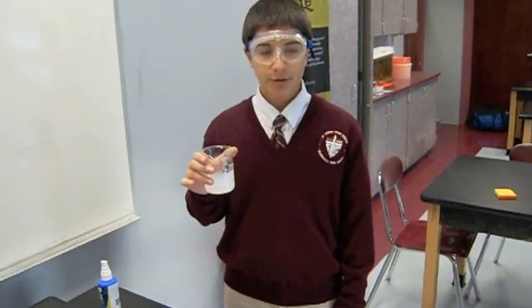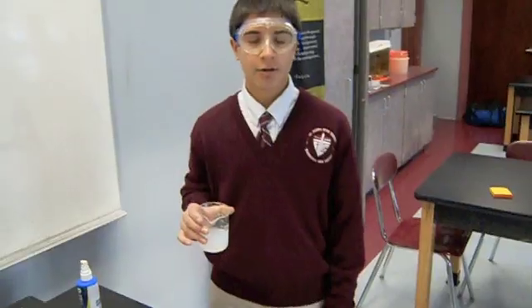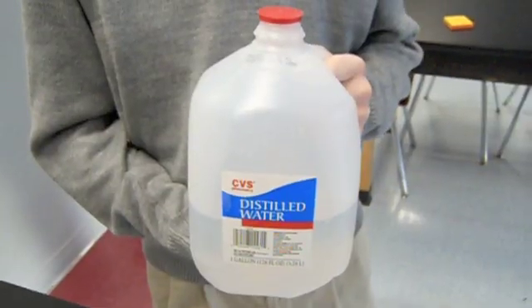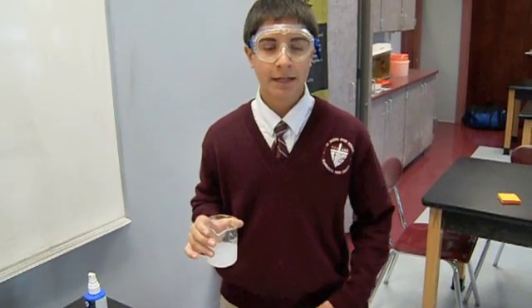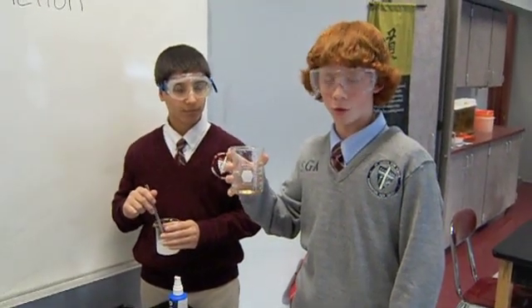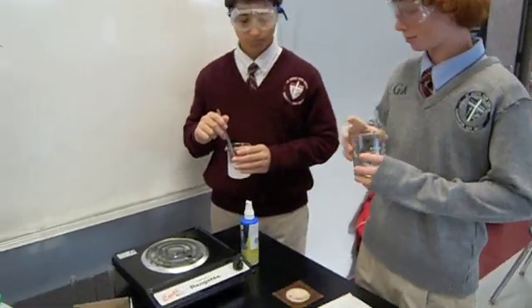To get our starch solution, we added one gram of cornstarch and put it in a beaker of 100 milliliters of distilled water. We stirred it frequently and heated it until it boiled. Now you must fill out your 250 milliliter beaker about three-fourths of the way full with water and place it on the hot plate.